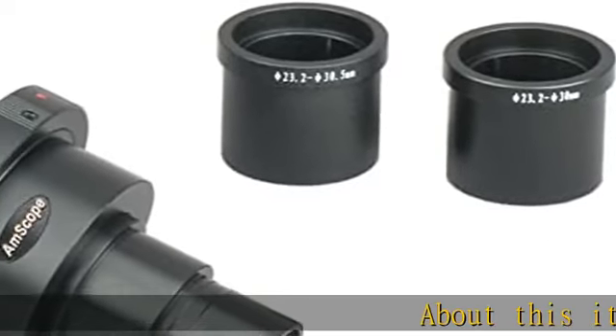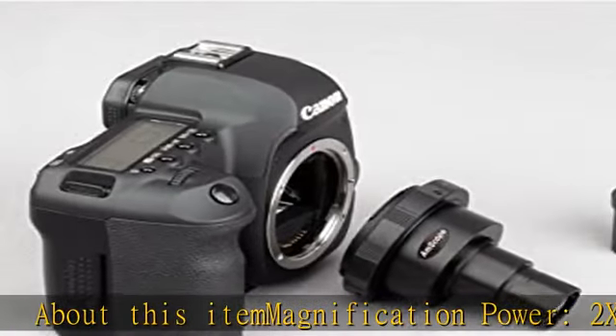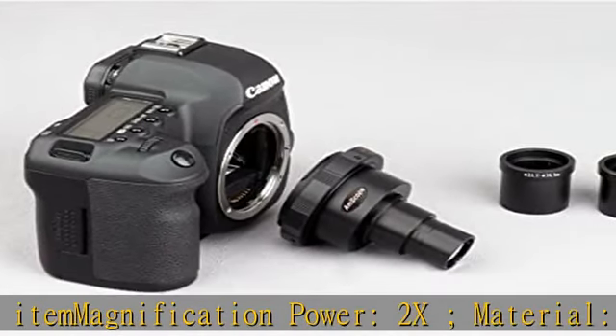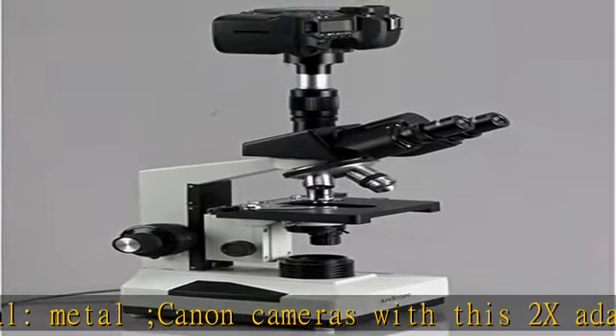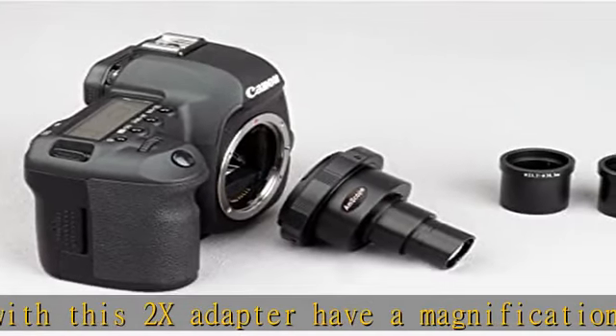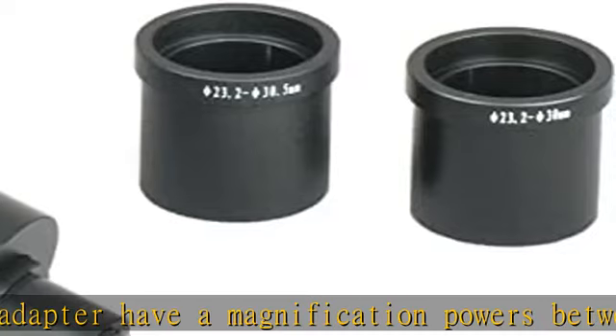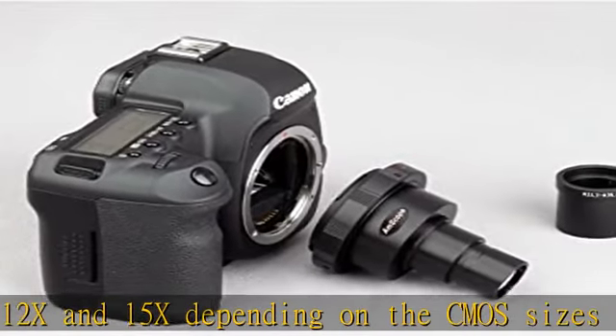About this item: magnification power 2x, material metal. Canon cameras with this 2x adapter have magnification powers between 12x and 15x depending on the CMOS sizes of the camera. Mount connection standard 23.2mm, works on monocular, binocular, or trinocular photo/video port. Check the description to get this product today at the best price.